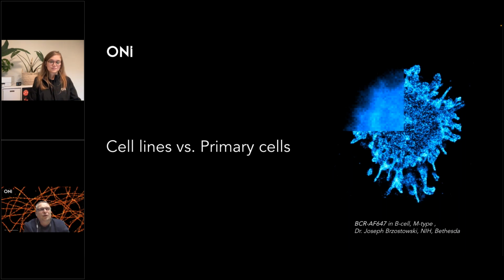So if you are looking for a movement in live cell imaging of, like, mitochondria, they are very slow moving organelles. But if you are looking for, like, vesicles, lysosomes, they are very fast. So in this scenario, you will not be able to use high resolution, at least not single molecule localization microscopy, to resolve the structures of these.